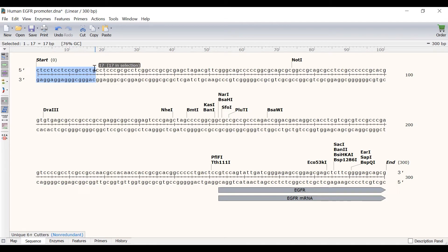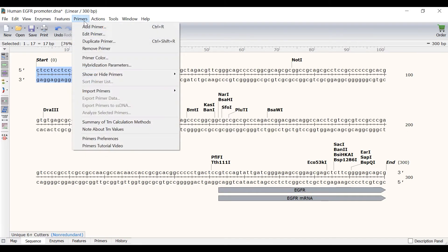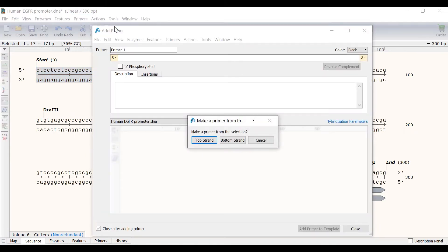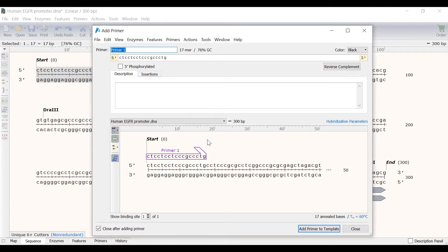To add this as a primer I will go to Primers, Add Primer. Since this will be the forward primer I will select to make a primer from the top strand sequence. I will then call this primer EGFR.4 and I will also add a short description for my own reference.